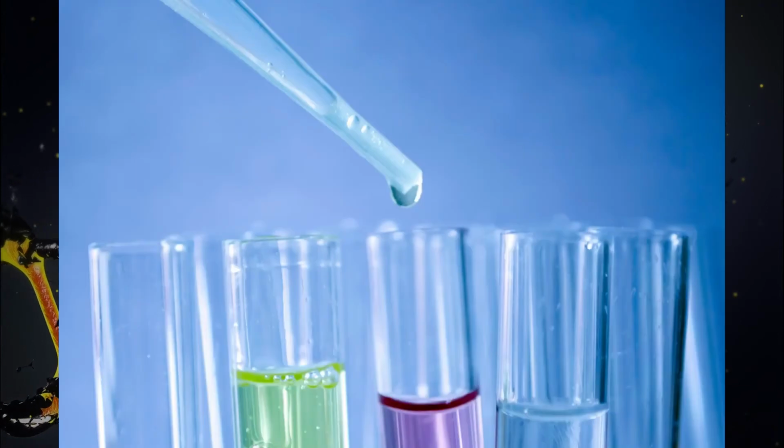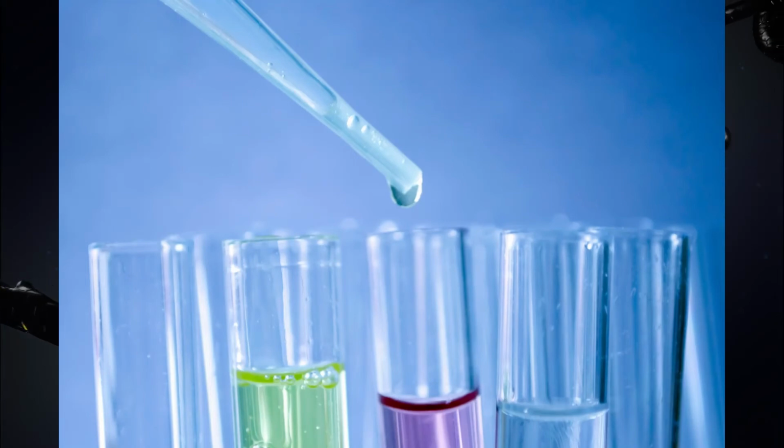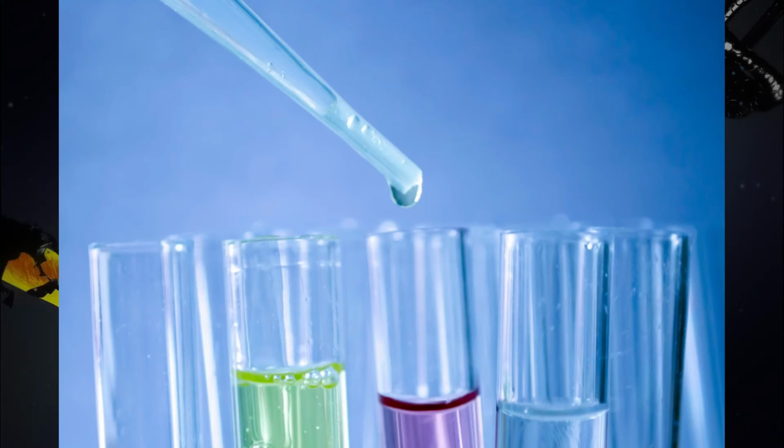This can then be further refined again by addition of certain agents that would block DNA binding at lower temperatures than the primary intended range. This means that you can ensure that only the desired ranges as far as temperature goes work.